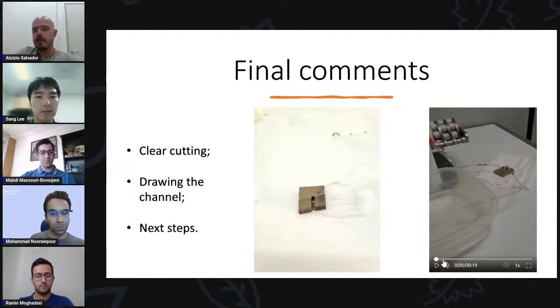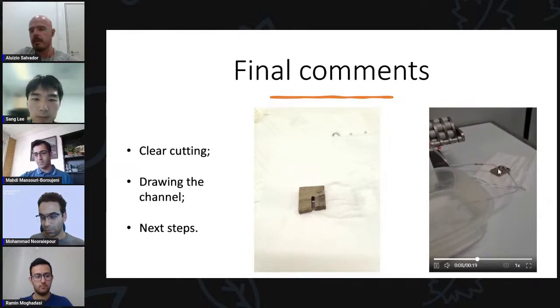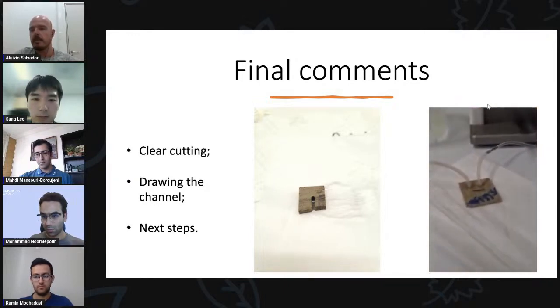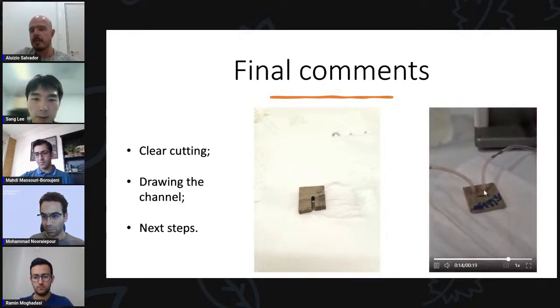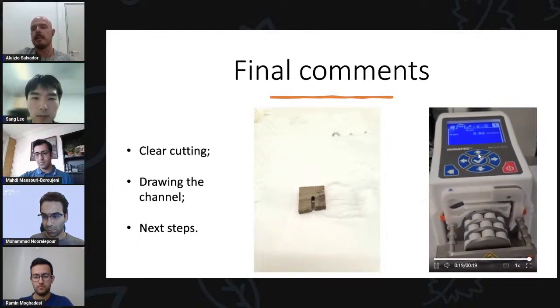And here is a little movie, as just shown, of the rock, the channel of the rock. And here is the peristaltic pump we are using. The channel is upside down there, and we use a flow of 0.5 milliliters per minute.